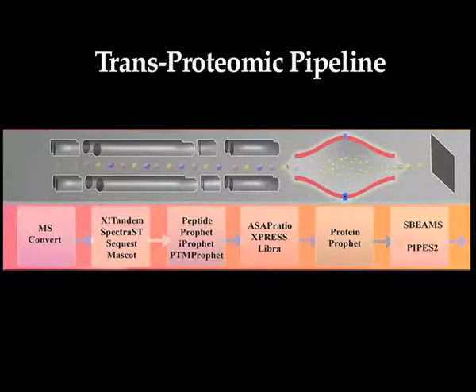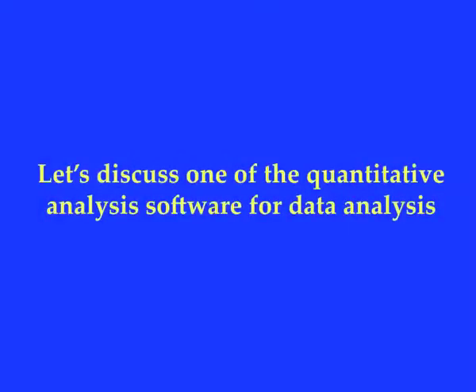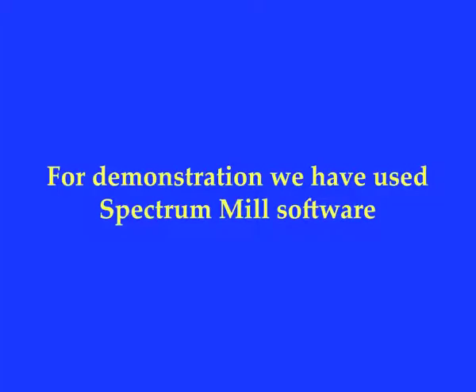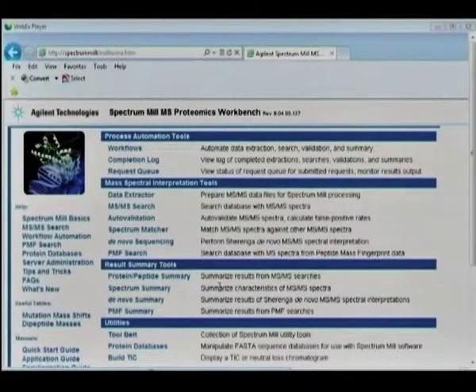Apart from the software mentioned in the table, many open source software were introduced in recent years, such as Trans-Proteomic Pipeline (TPP), OpenMS, MaxQuant, and many more. We will focus on the iTRAQ data analysis using SpectrumMill software.